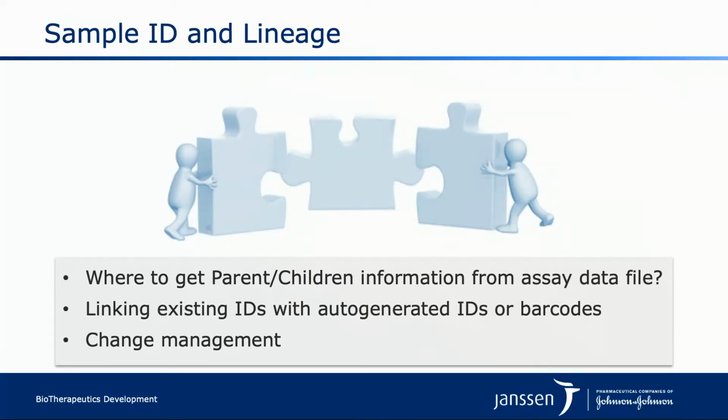Another question is how we make this ID easy to use. Because LabKey can easily generate 100,000 IDs, but it's just a number. Maybe you can design some tags into it, but how do we make it easier for the scientists to use, putting it on their bioreactor, on their tubes, plates? That's become the challenge for us.